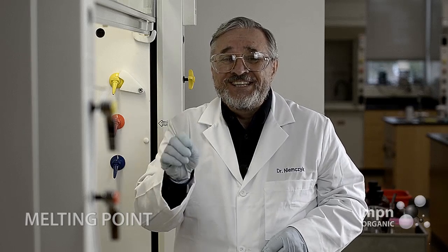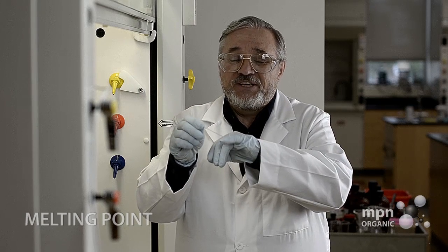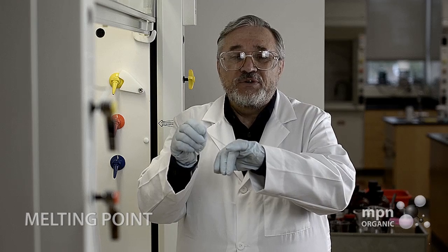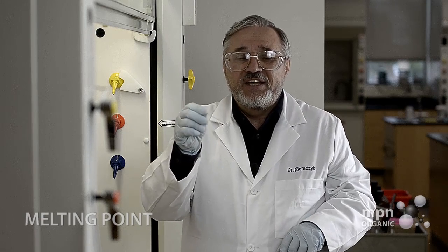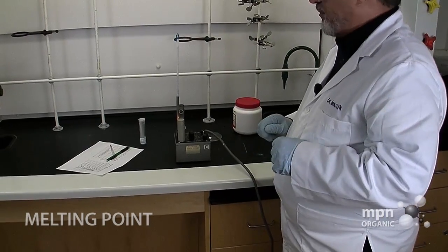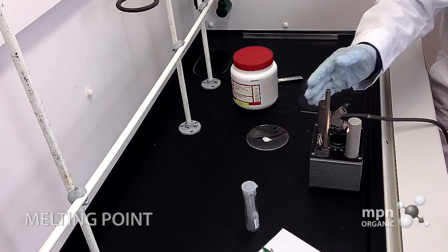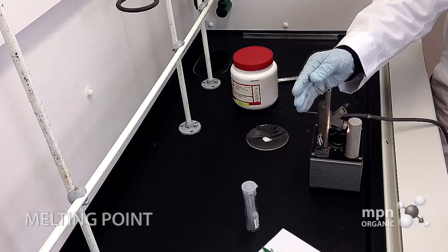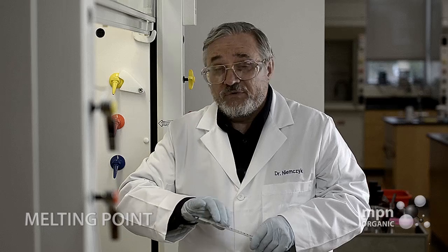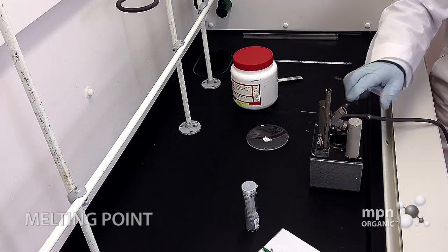Now, a couple of things to remember. We don't clean these, all right? I've had students try to scrape out the solid in there. What we do with these is put them in a throwaway glass receptacle. So we just throw that away. The second thing is that we allow this aluminum block, which is now quite hot to the touch, to cool down for several minutes.